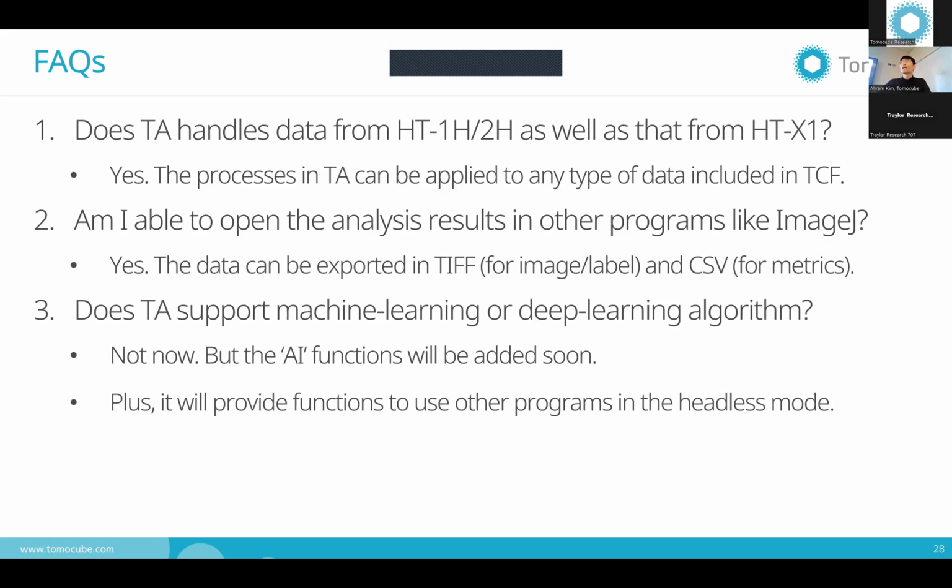So when we are confident, there is very weak absorption when the line is at the value.